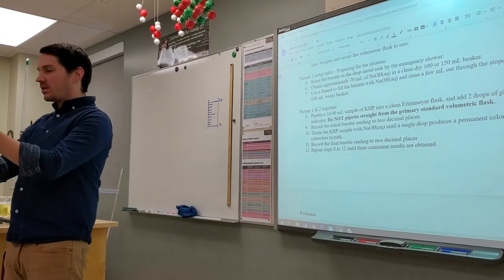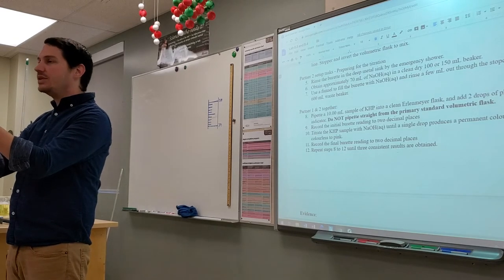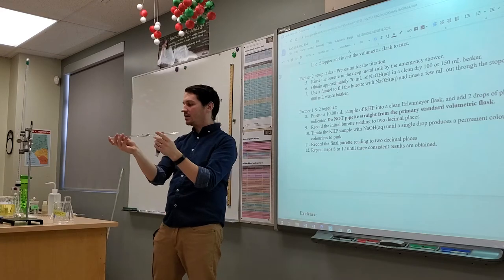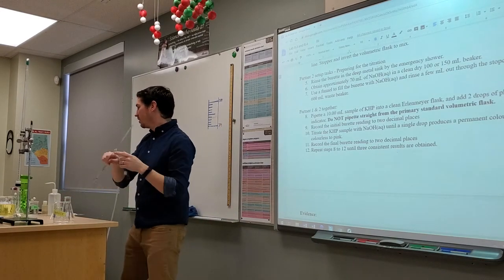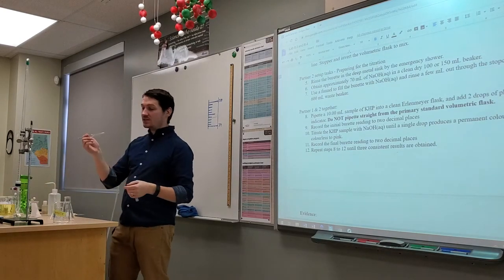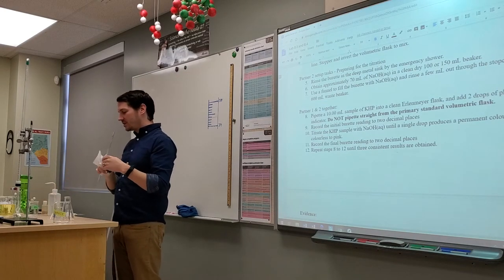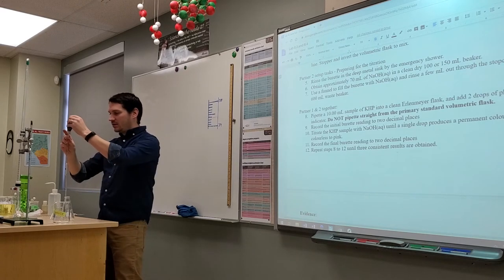and then just kind of coat it the same way you did with your burette. I would do the exact same thing. And then I would dump it out the other end, the top end, okay? I'd dump it out the top end, and then I would just clean it off, and now you're good to go. So now you've cleaned out, have we successfully rinsed out any stuff that was in here? Yep, perfect, love it, awesome. Now we can go ahead and we can pipette it.